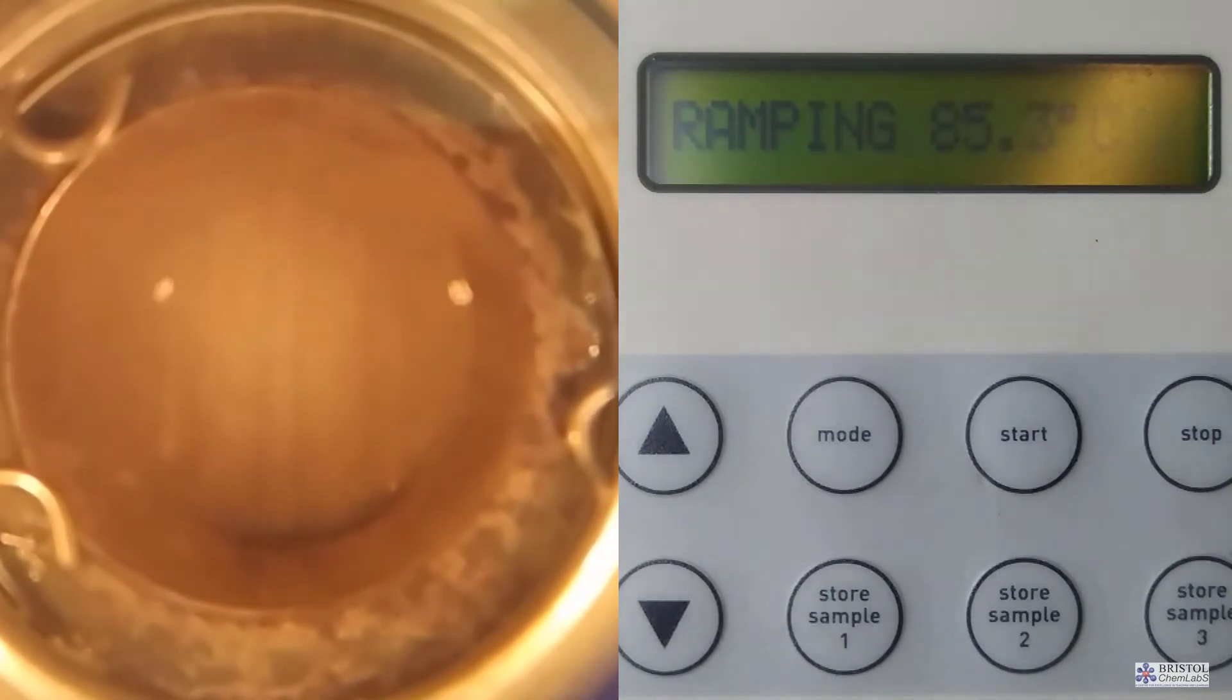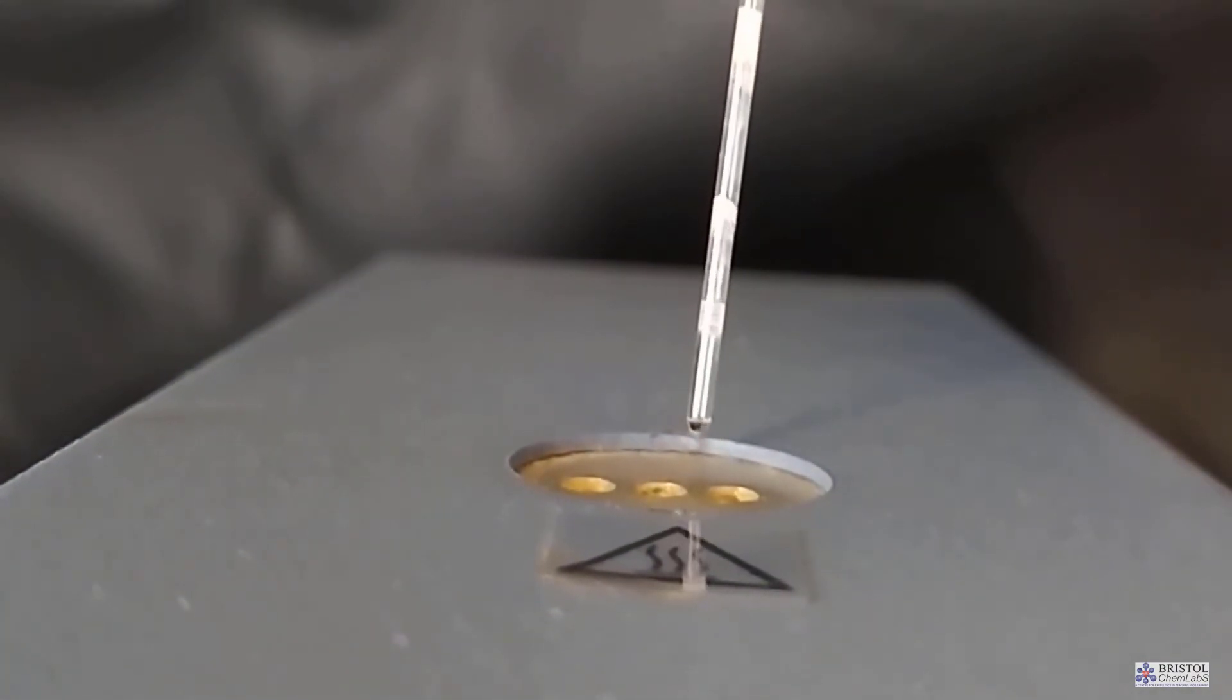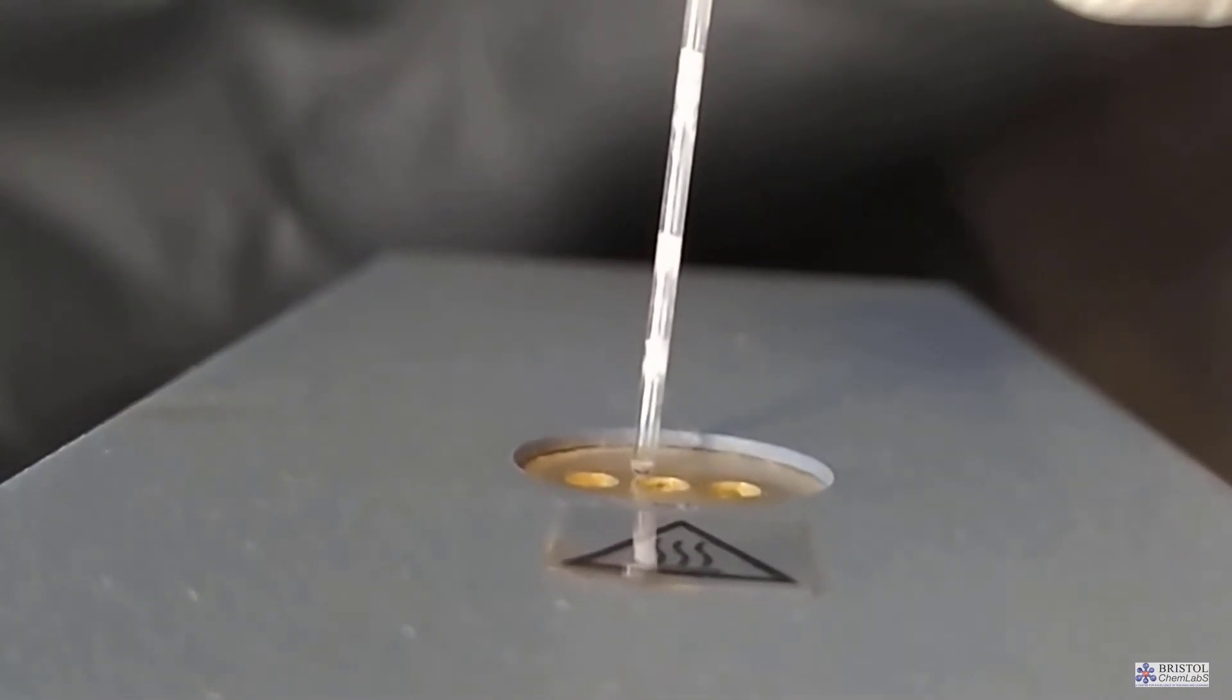One simply looks through the lens through the window of the apparatus and judges when the solid becomes liquid and makes a note of the melting point. Used capillary tubes are considered sharps and should be disposed of in a sharps waste bucket or bin.